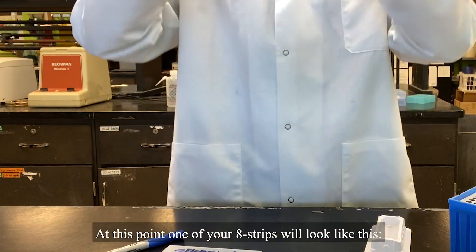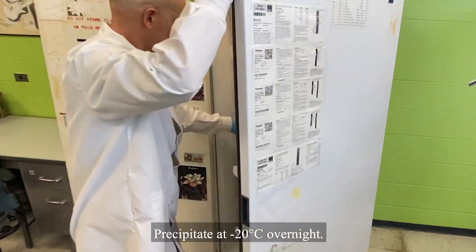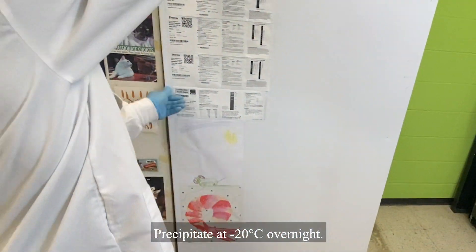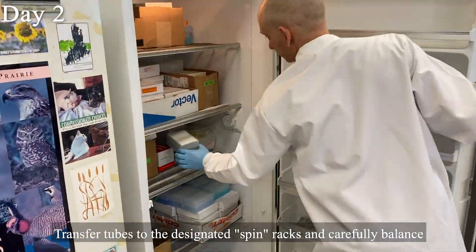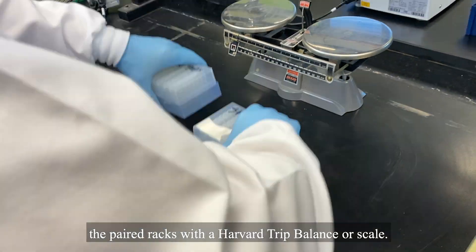At this point, one of your eight strips will look like this. Precipitate at minus 20 degrees Celsius overnight. Transfer tubes to the designated spin racks and carefully balance the paired racks with a Harvard trip balance or scale.